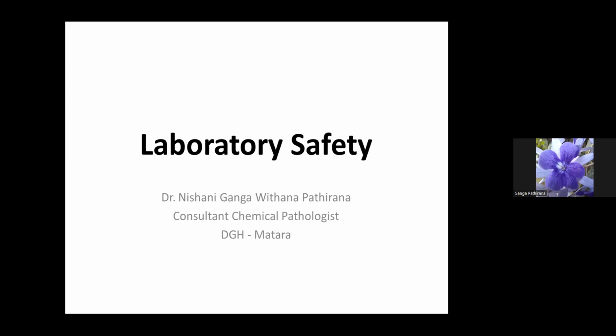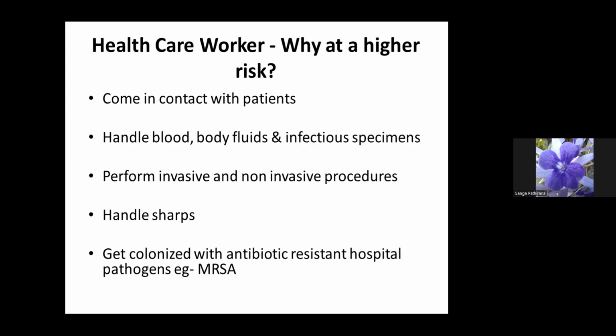During the next half an hour, I would like to share my knowledge regarding laboratory safety. As healthcare workers, we are at a higher risk. Why? Because all of us come in contact with patients, and we handle blood, body fluids, and infectious specimens, and we perform invasive as well as non-invasive procedures, and we handle sharps, and we get colonized with antibiotic-resistant hospital pathogens like MRSA.